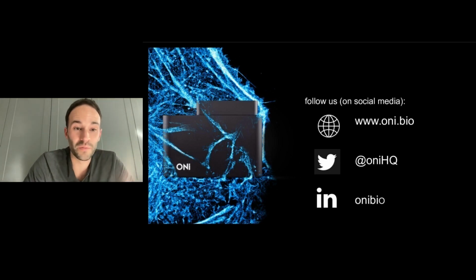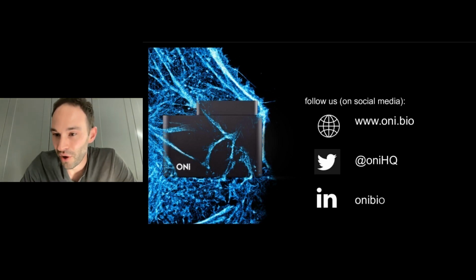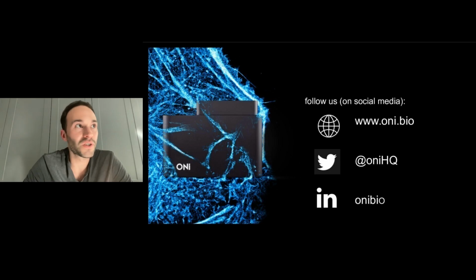We don't know this for most of these things, and sometimes people put a domain into a CAR and it makes no difference, and it's possible it's just not recruiting the thing it's meant to recruit. So I think that is really very high potential, because as I mentioned, for localization microscopy, you see one molecule at a time. So you really build up the cluster and you can see these details really effectively.